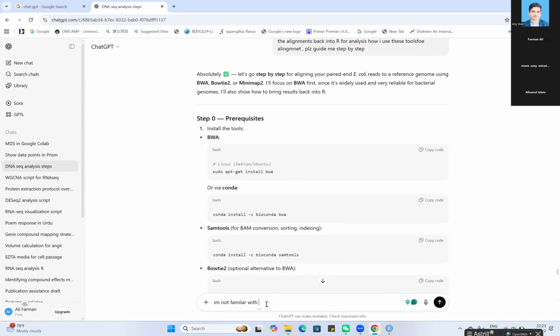Please guide me step by step so that I can perform this task. I just have Windows and R. Okay, send this message again.